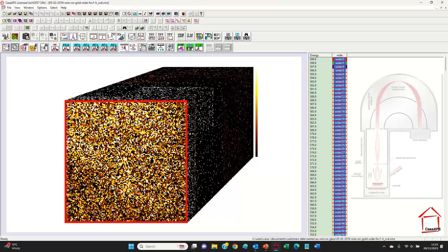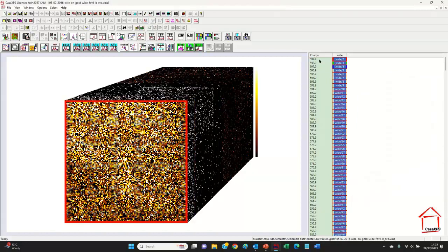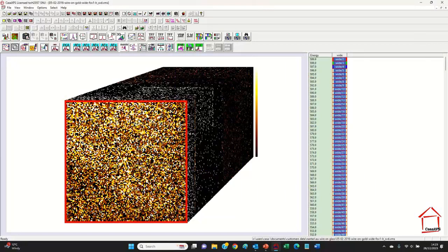This is an imaging XPS dataset. It's imaging in the sense that these data have been measured by stigmatic imaging, and these images are acquired at a given energy. So if we have a range of energies of these images, then we're dealing with XPS, meaning spectroscopy. In principle, if we sum all of these pixels on these images and assign the intensity to each one of these energies, then we have constructed a survey measurement over the energy range that these images span.